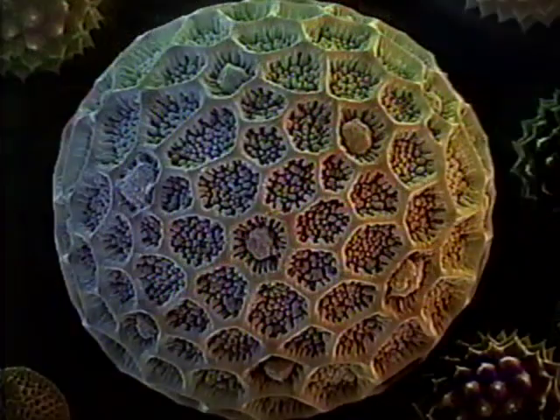We work with the walnut growers every year. In about December, they have to look at their meat crop, the walnut meat, for the next year, and if they have a bacteria in the meat crop and they have to wait to see it, then of course the meat's already eaten. So we look actually in the seed and we can see if there's bacteria starting, and they can spray it immediately. So we've saved many crops in the walnut fields, and so that's very helpful to them.